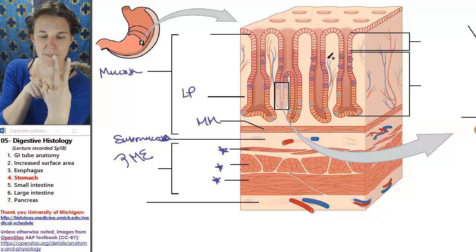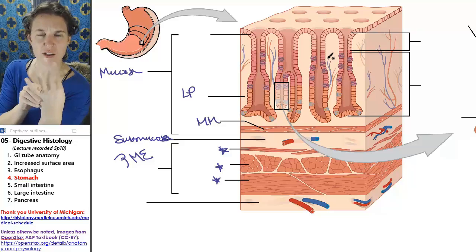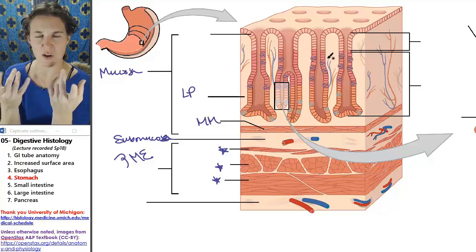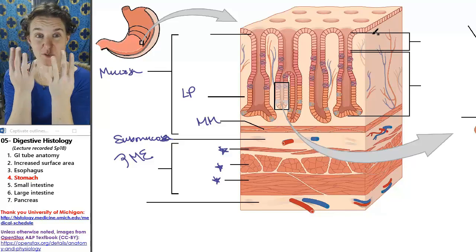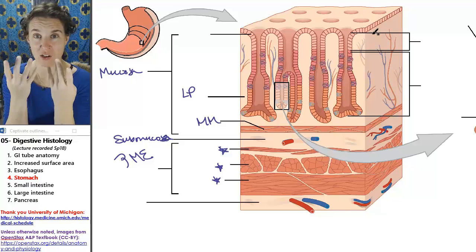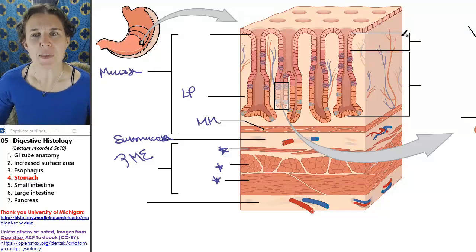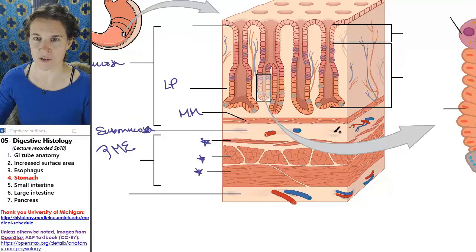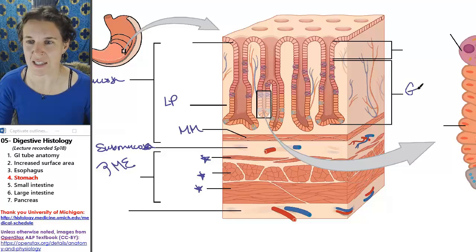The lamina propria is down here, and the fingers can float around in the mush and gush and do their absorbing. This, look at my surface. My surface is not wispy and wavy with finger-like projections. My surface is actually flat with holes in it. These things right here, why does it do that? I don't know. These are actually gastric glands.